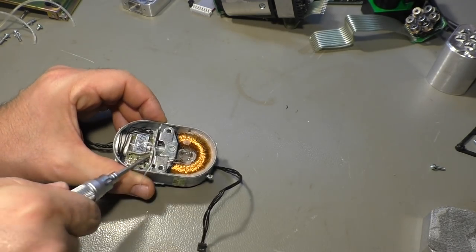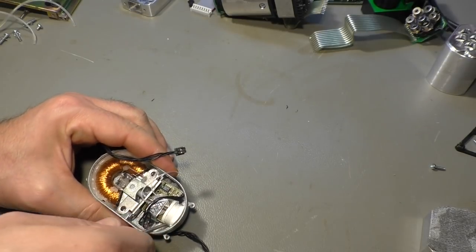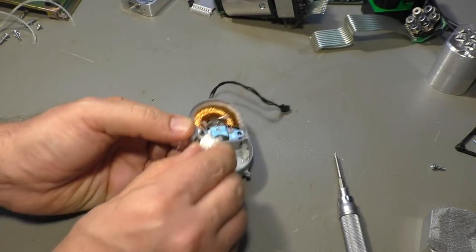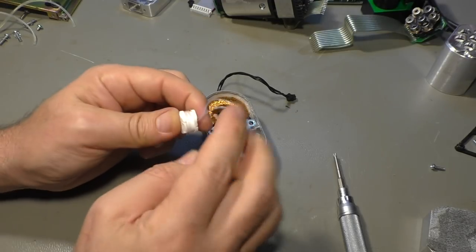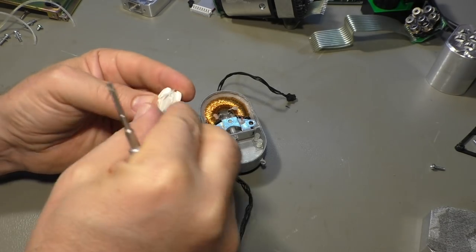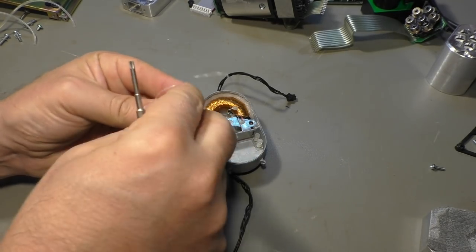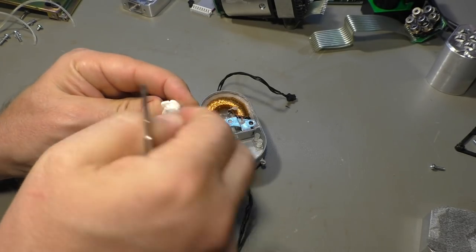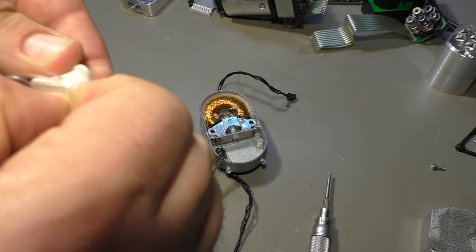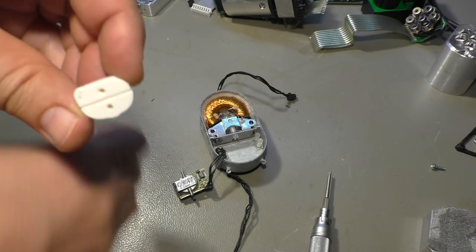There are some hoses here. That's the electrical connections. Then they spun the hoses around this. Okay, the entire electronic block comes out. So what are they doing with these hoses? Super small plastic hose. I don't know where I could use that, but certainly difficult to get if you need one. So they spun it around a couple of times and then they glued it in place here. And here, okay, so they connected it to the holes here.